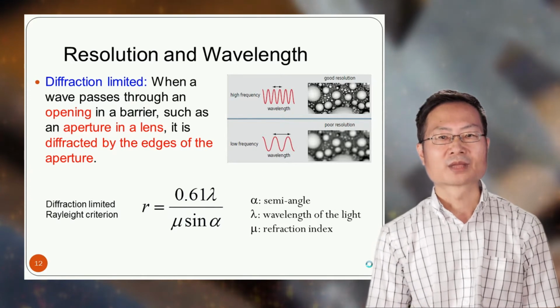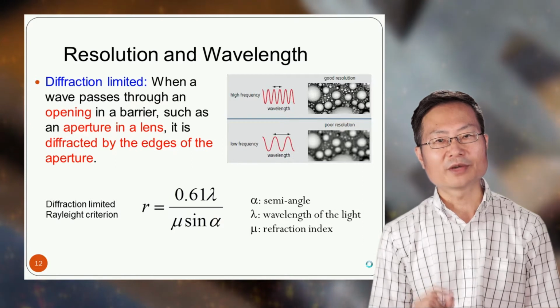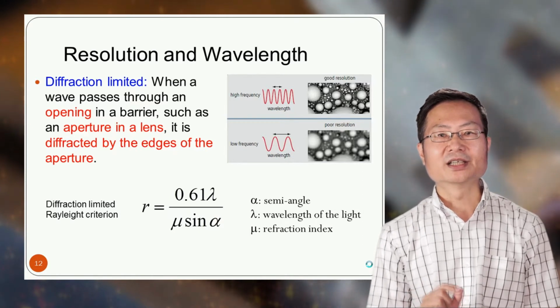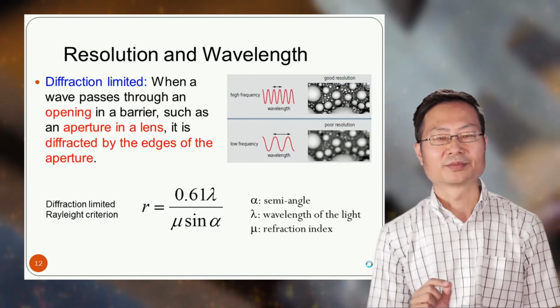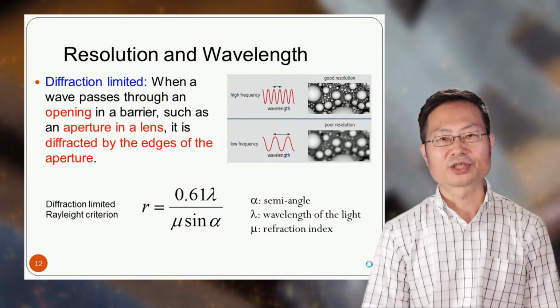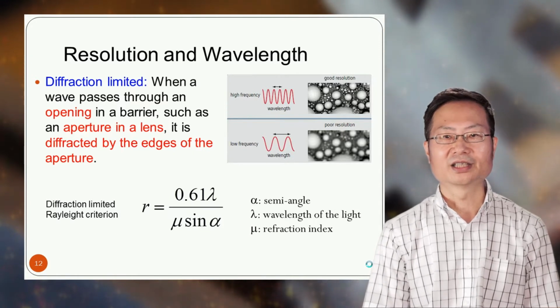Aberration is formed. According to the equation, the resolution is proportional to the wavelength of light. It is the physical resolution limit for an optical system. So if you want to improve resolution, using shorter wavelengths can get a clearer image.